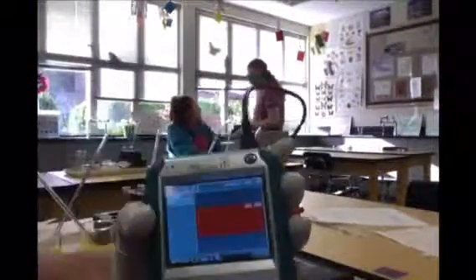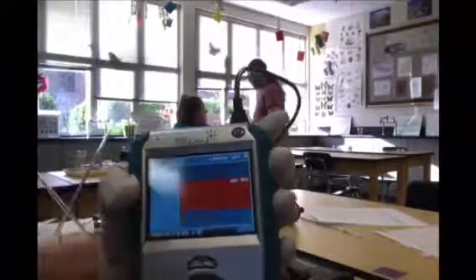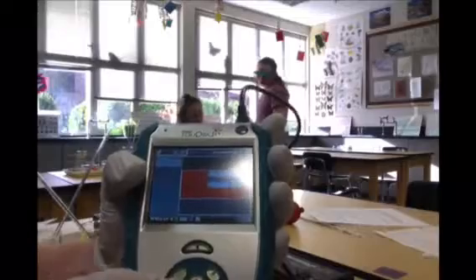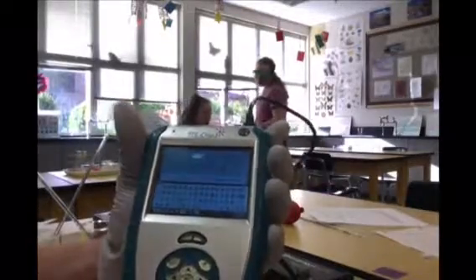Now prior to putting the cuvette in, what we want to do is make sure the spectrometer is plugged in, and so that it's plugged into this mechanism right here. And once you plug it in, it's going to say absorbance right there in the red box. And you're just going to select that red box and go down to change wavelength. It's going to ask you what wavelength we're looking for, and we are in fact looking for 500.